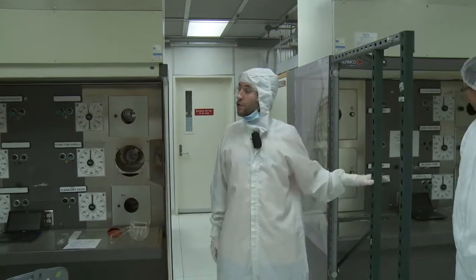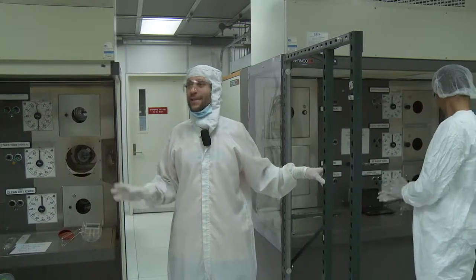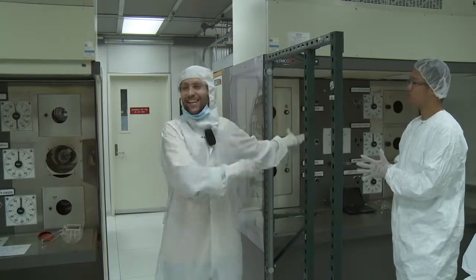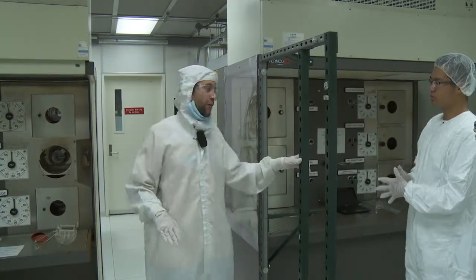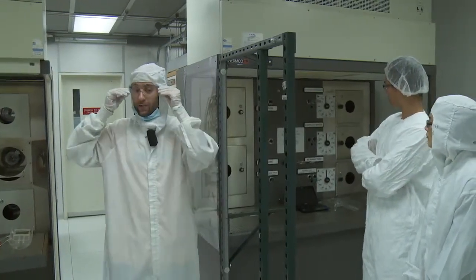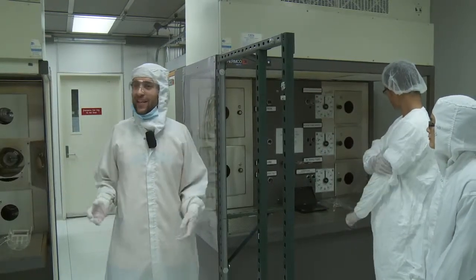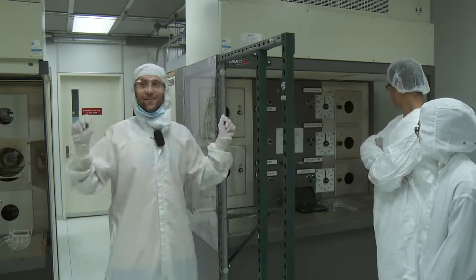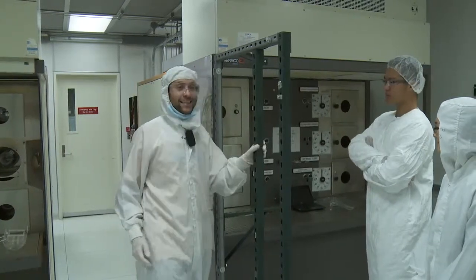That other one, some groups here use to research what's the trendiest material you can think of now in science. Exactly. So here some groups are starting to try to grow graphene on the surface of certain materials. I don't know how they do it. To be sincere, I don't know how successful they are either. But obviously graphene is what gives you money now for grants, so we have to have it. So we're investigating with graphene. Woo! Give me money.